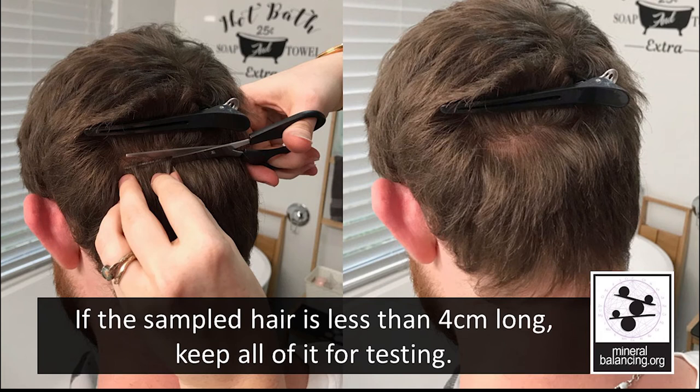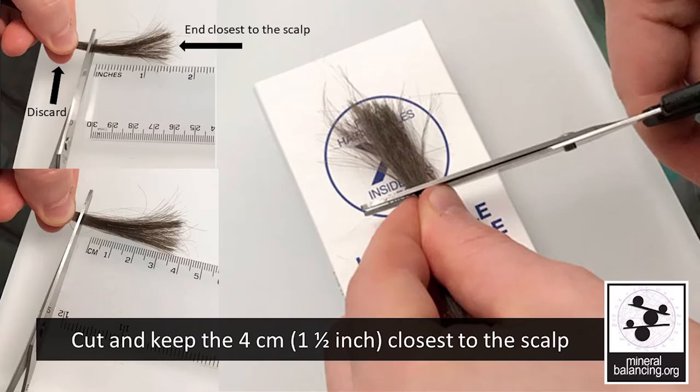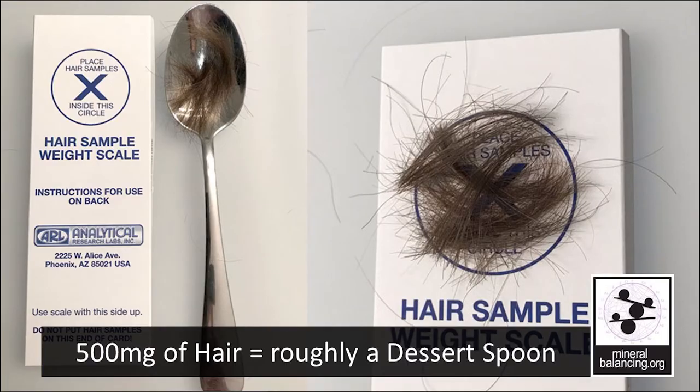If the sampled hair is less than four centimeters long, keep all of it for testing. If you have a shaved head, we will describe how to prepare your hair sample near the end of the video. If the hair is longer than four centimeters, measure and cut the sample and keep what was growing closest to the scalp, discarding the excess. If you have a hair kit, you can use it to measure the perfect amount of hair with the cardboard scale, which will tip when it has enough hair. If you do not have a paper scale, you can use a jewelry scale and weigh out half a gram of hair. You can pick one up at a very reasonable price online.